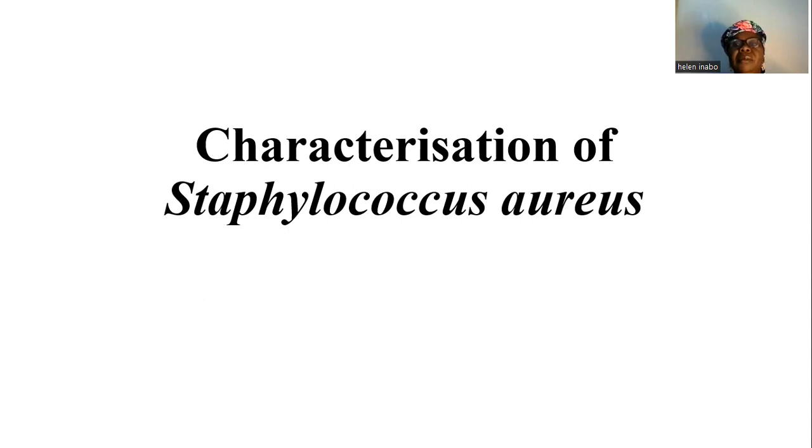In continuation of the discussion of the basic microbiological tests or protocols, I'll be discussing the characterization of Staphylococcus aureus.